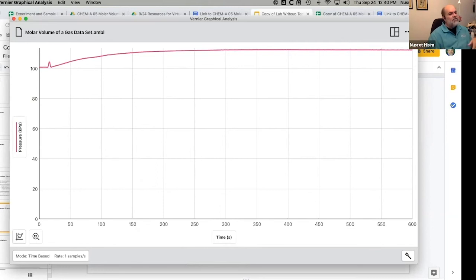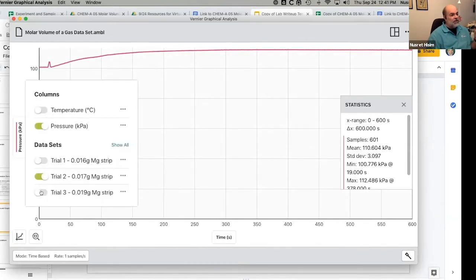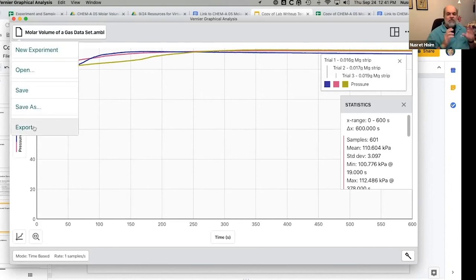They can adjust the axes and annotate. Once the students have it the way it needs to be — maybe all three trials showing — they can turn on a legend so you can tell which trial is which. All kinds of things to make it look nicer. Now, to create a lab report: under the file menu — cleverly looking like a little piece of paper with the corner flipped over — notice there's no 'Print.' How are you supposed to print this? Graphical Analysis runs on iPads, Android, Chromebooks, and Windows PCs — making print work on everything would be a programming challenge.